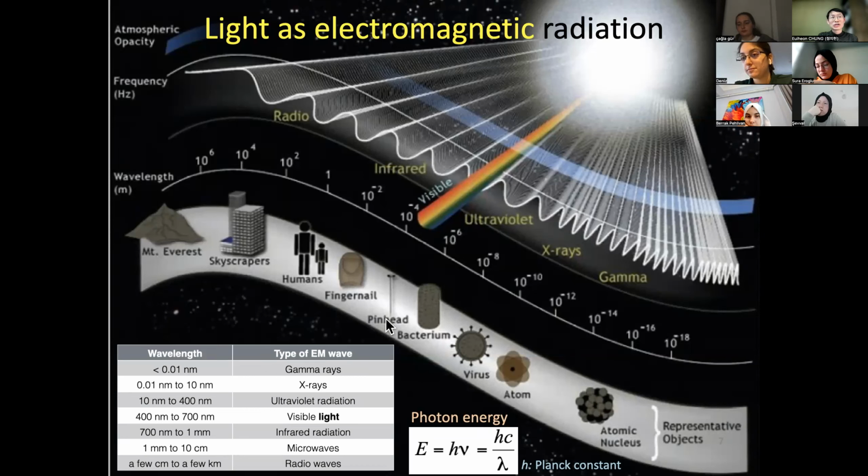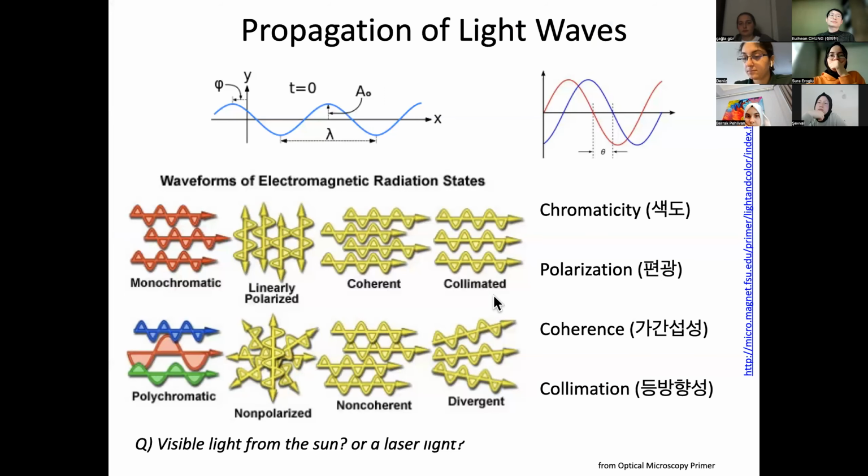These depictions show the size of the wavelength. All right, so for light as a wave, you will be familiar from your basic mathematics class that waves can be described by the wavelength and also the phase. Phase means the wavefront relative to another one.